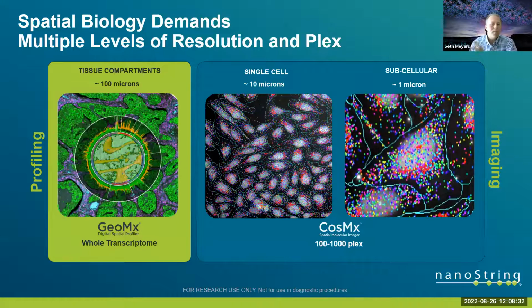And so we've come to recognize within spatial biology that there are multiple levels of structure, from macro tissues to individual single cells. And each of these requires a different level of resolution to interrogate. So the level of plex that's required also varies with the question that the researchers are asking. So a 100 plex panel might be sufficient for looking at specific biomarkers or to perform high-level cell typing. And increasing that plex to thousands of genes allows researchers to interrogate differences in biochemical pathways. And a whole transcriptome approach enables an even broader discovery of novel biomarkers.